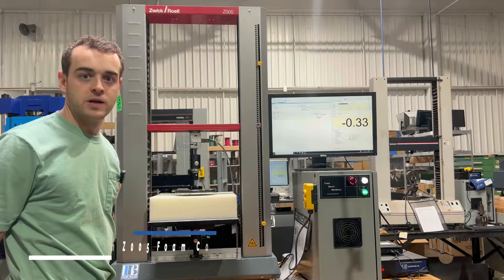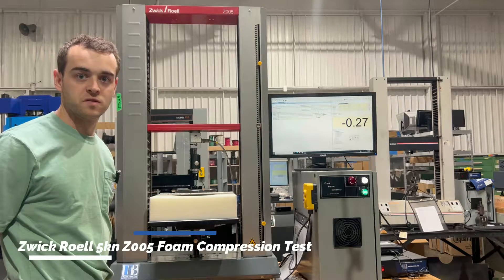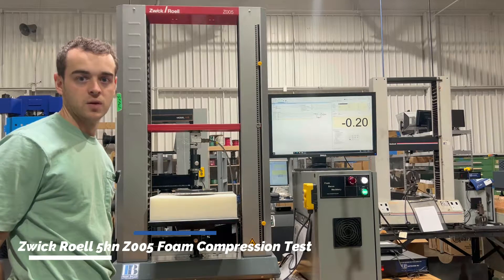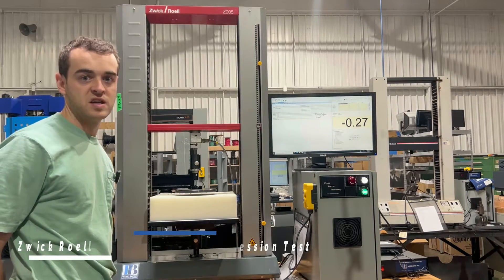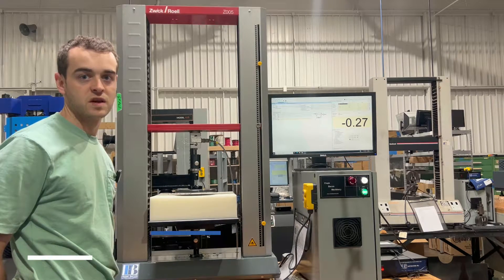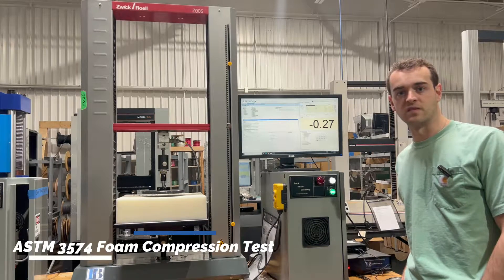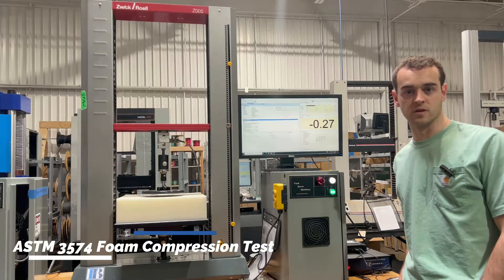Hey everyone, Chuck here with Frank Bacon Machinery, here to show you a machine that we just retrofitted and upgraded. This is a WIC 5 kN system that we specifically did for ASTM 3574. It's a foam compression test. We have this ASTM completely pre-programmed for the customer.